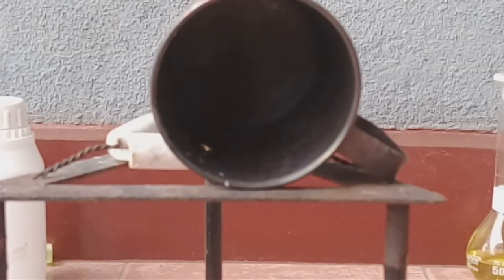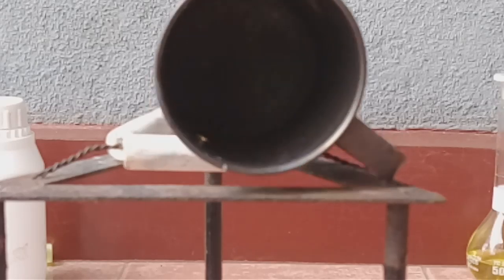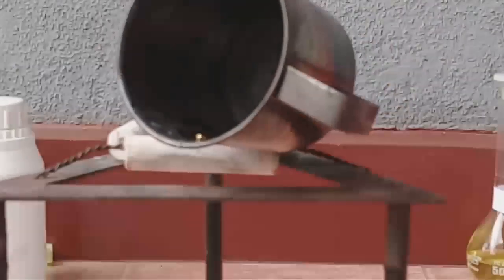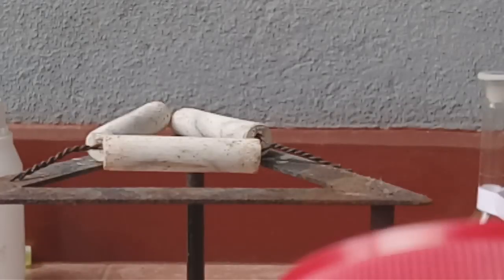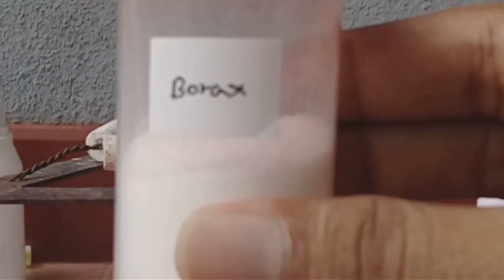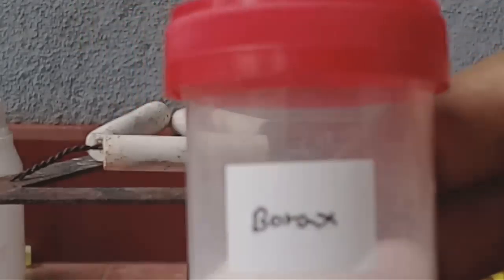Now all the reaction is done. You can see here nice color gold crystal. Before the heat I added some borax to this gold precipitate. It helped to melt down this gold in low temperature.